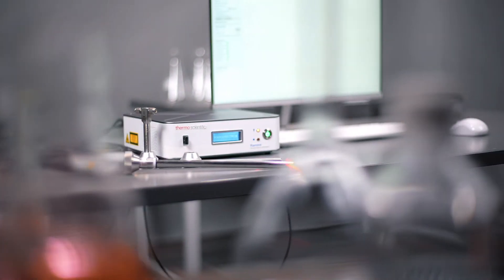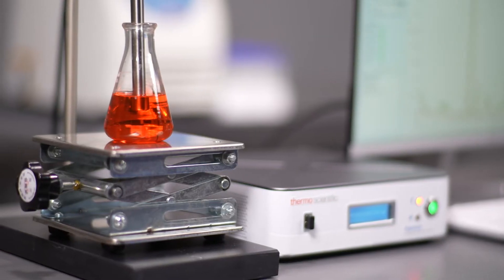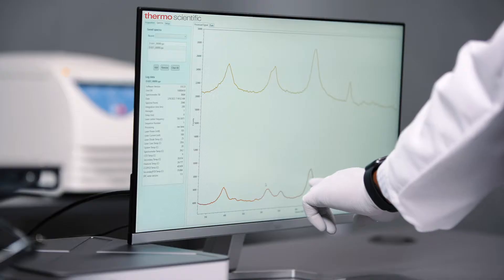Our new ThermoScientific Romina process analyzer is a compact and portable Raman spectrometer, utilizing patented technology, purpose-built for rapid deployment, ease of use, and scalability.